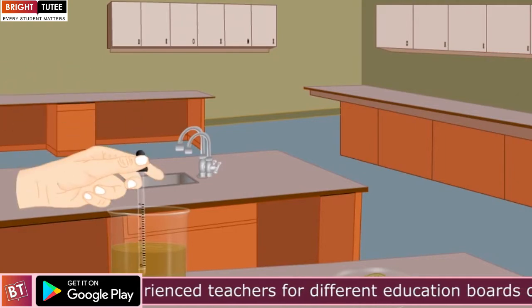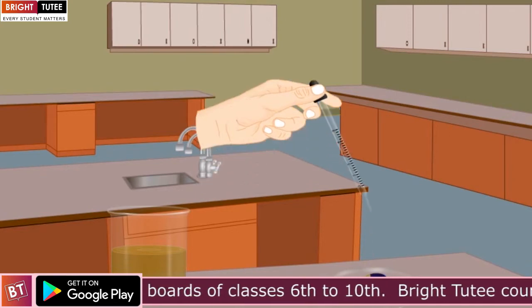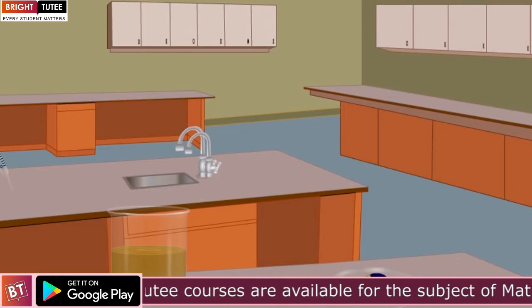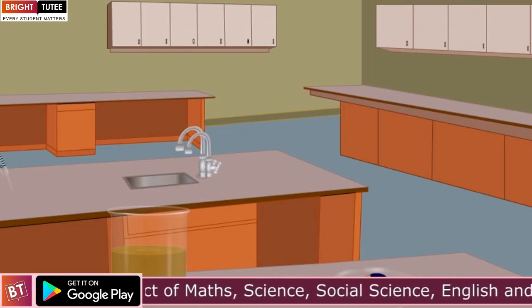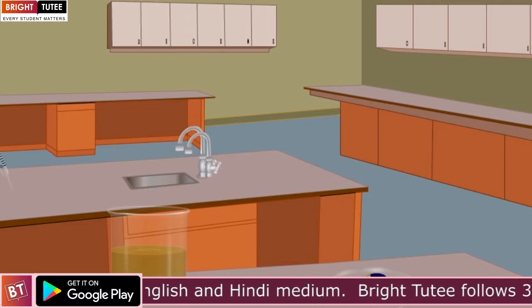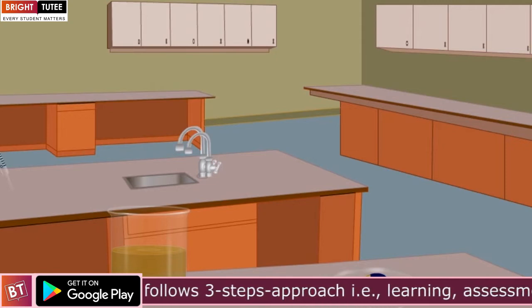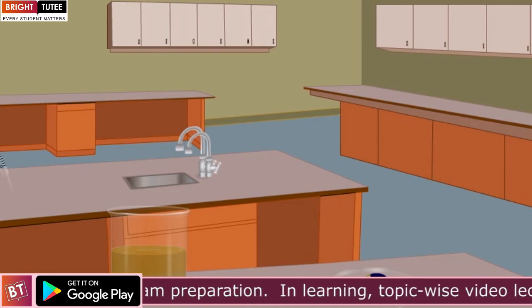Now, put this leaf in a petri dish and add few drops of iodine solution. You will notice the change in the color. The iodine changes into blue-black only if starch is present. So this change in color is only in half of the leaf which was not inside the beaker. The portion which was inside the beaker, so no carbon dioxide was available, there was no change in color. So this activity shows that carbon dioxide is necessary to carry out photosynthesis.